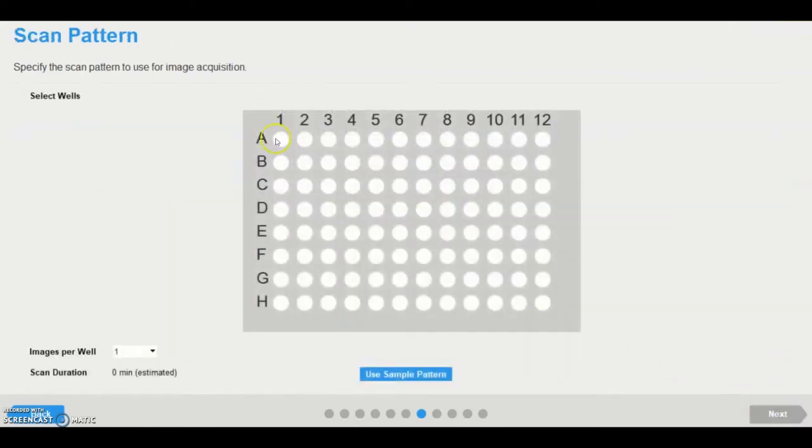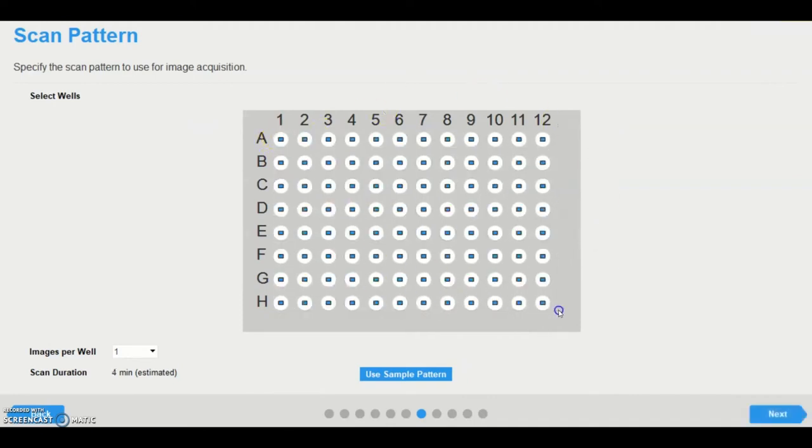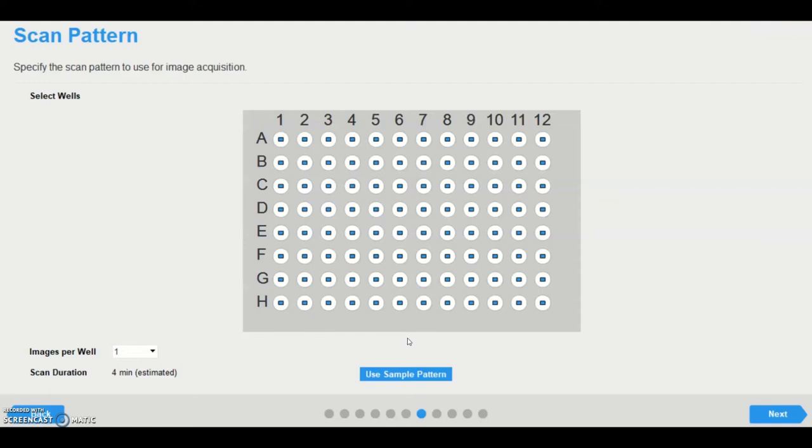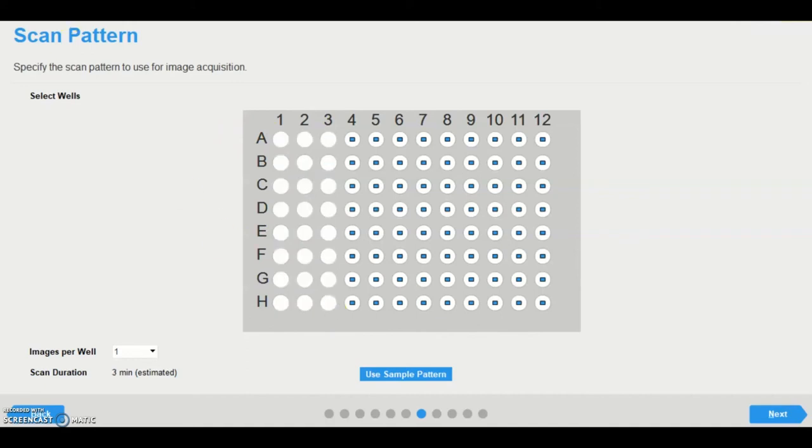The scan pattern page displays a vessel overview, which allows the user to select the location of wells within the vessel to be scanned. When scanning microplates, it's very important to not select wells which do not contain cells, as this can interfere with the Incusite's autofocusing. Once locations are selected, holding ALT before clicking and dragging will deselect multiple locations.